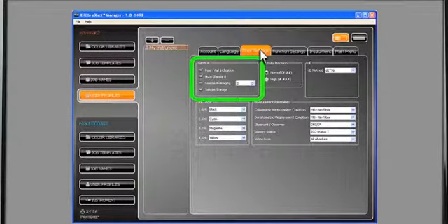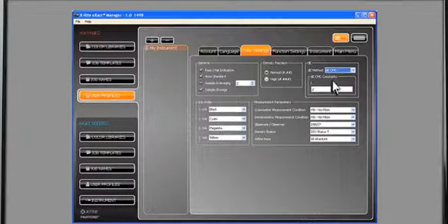Density Precision will allow you to select your measurement accuracy. Your choices are Normal, which will round to 2 decimal places, and High, which is more precise and will round to 3 decimal places. Under the Delta E method dropdown, you can choose the Delta E difference method to use for color measurements. Finally are the measurement parameters. These are more advanced options that may vary by user.